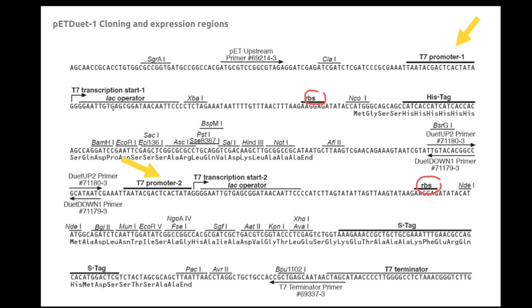So we are interested in domain 1 because both restriction enzyme recognition sites are in this domain. Do you remember the names? The first one was BamHI and the second was SalI, which is here. And underneath each name we see the specific nucleotide sequence. The first restriction enzyme would cut between nucleotides G and G. The second restriction enzyme is going to cut between nucleotides guanine and thymine.